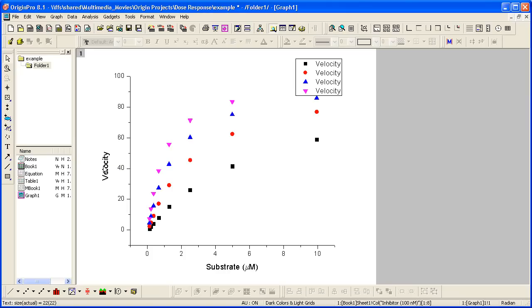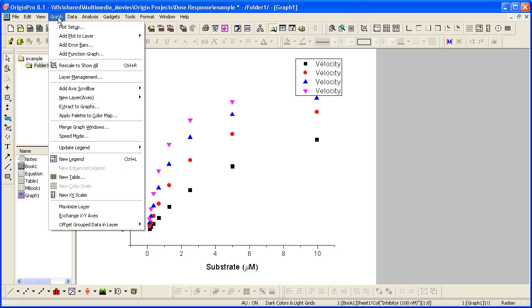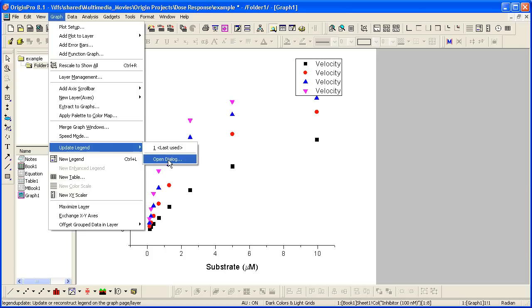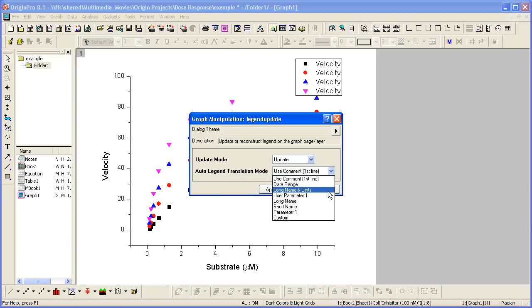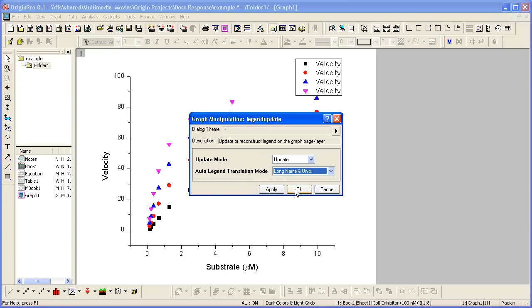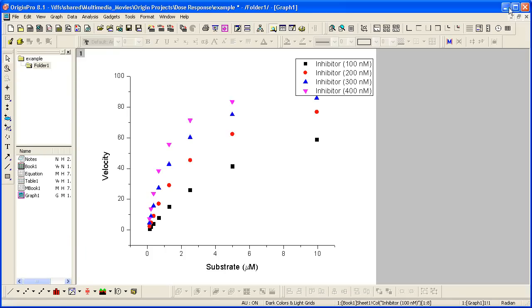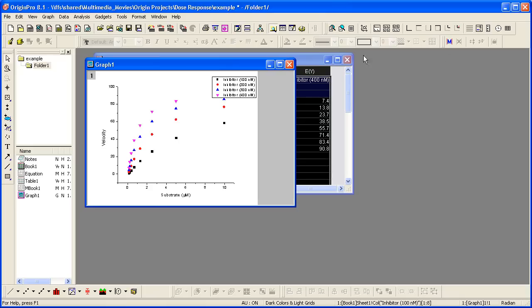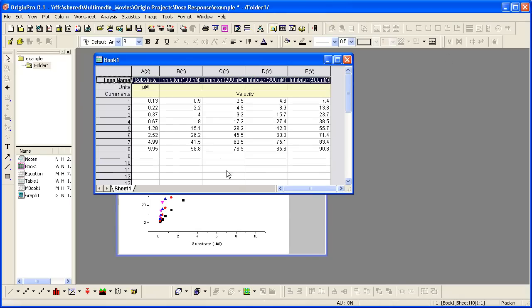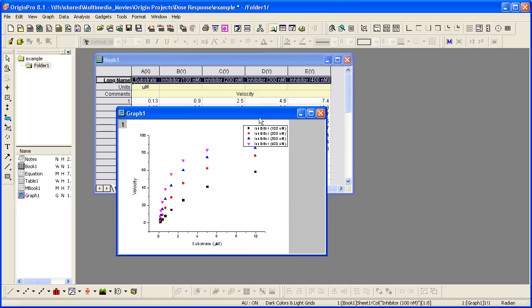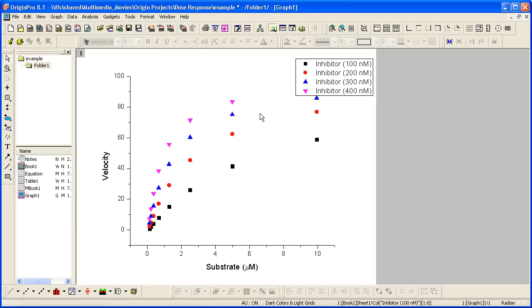And then we will pick up the information here for the legend, graph, update legend. And then let's use the long name and units. So that information was picked up from here and displayed in the legend.